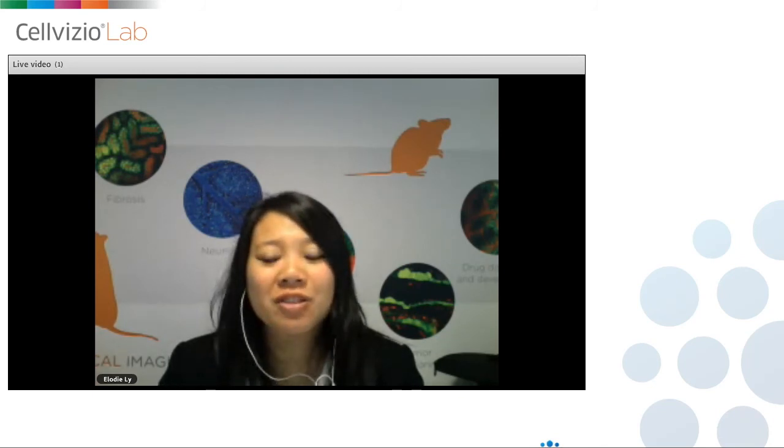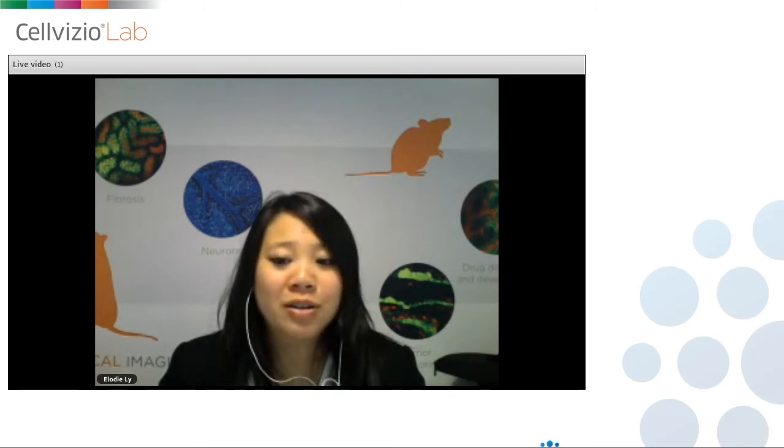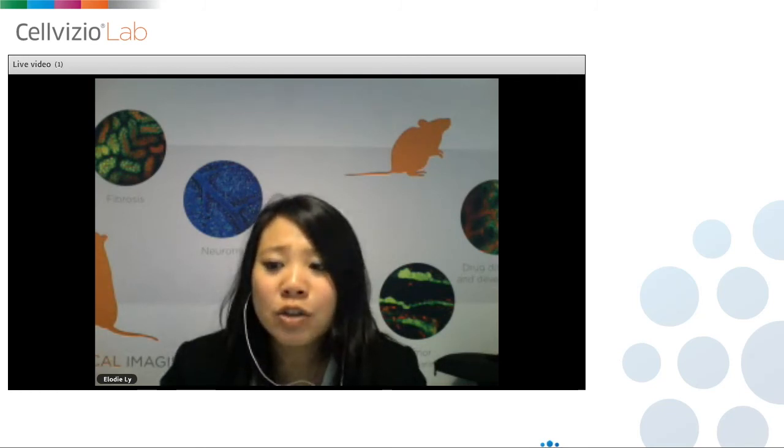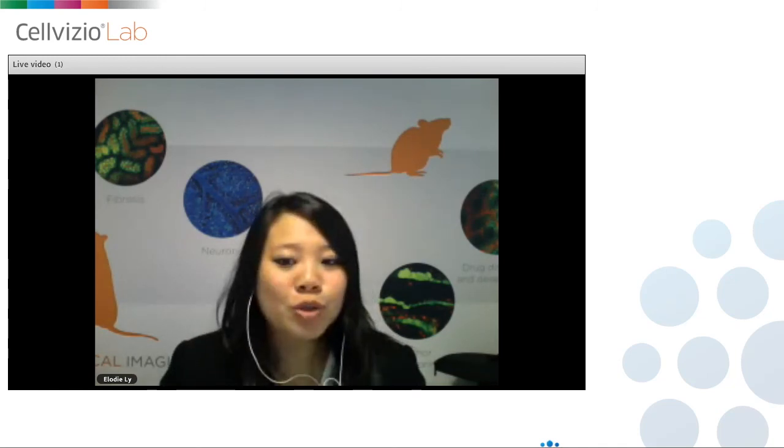We have a very recent publication from a lab in the US from Professor McNeek, who is looking at hippocampal vessels. In that case, you can use very thin confocal microprobes that have a beveled tip, so that these confocal microprobes can be inserted deep into the brain. So I can send you the reference for this type of article. If you have more questions, do not hesitate to type your question.